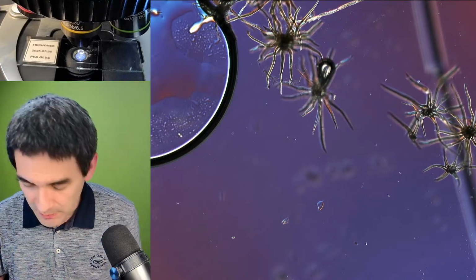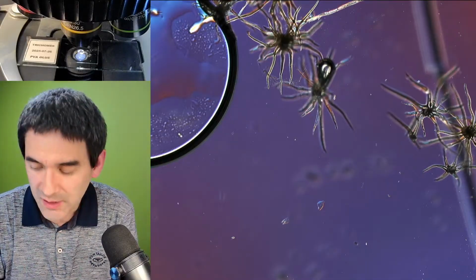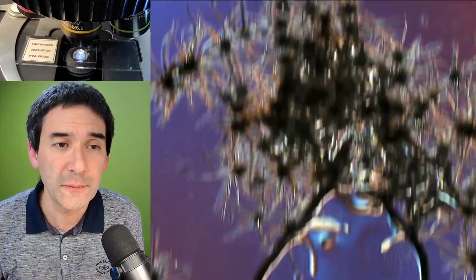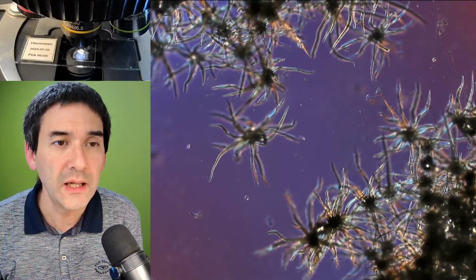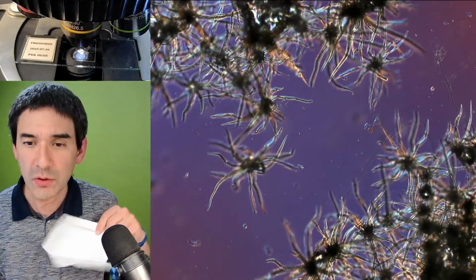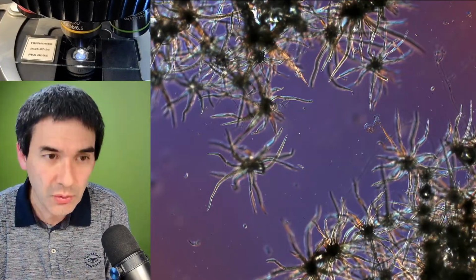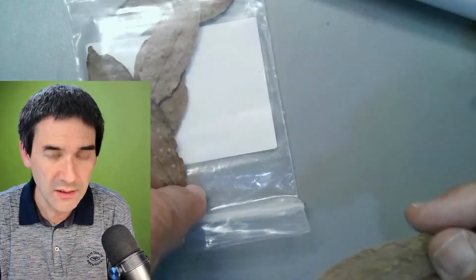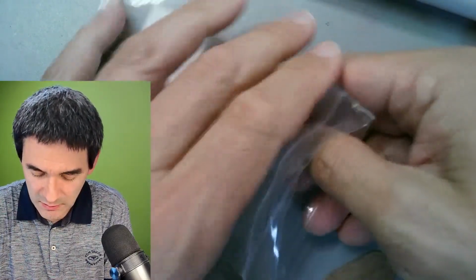I think it must have been the bottom of the leaf. And the top one is over here. So that is the thing that I wanted to show you. I'm now going to move on to the next topic because I'm trying to divide this a little bit into chapters. So I have to do the following: I'm going to put the leaf back into the bag.